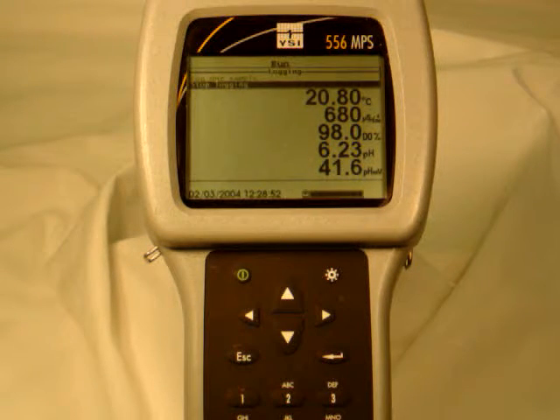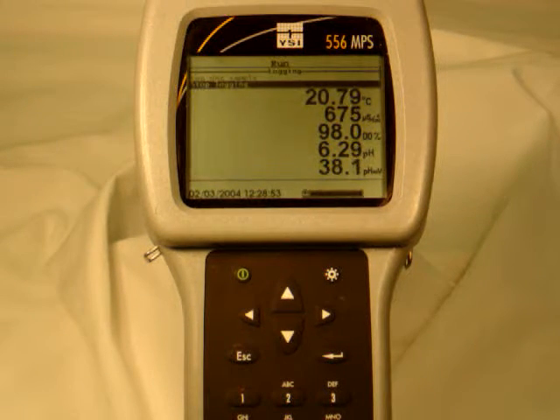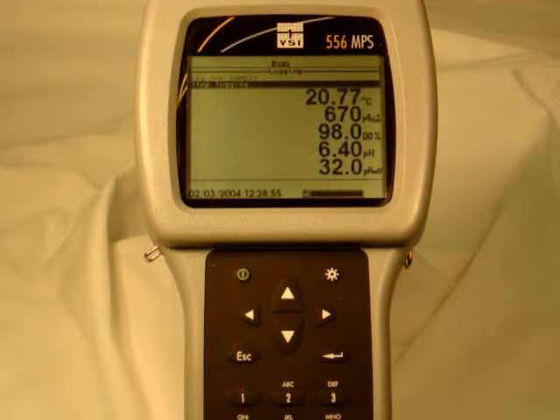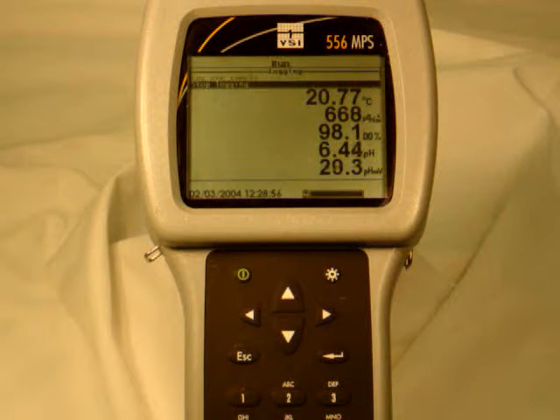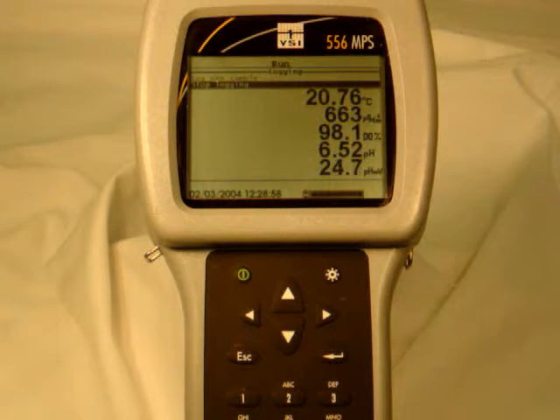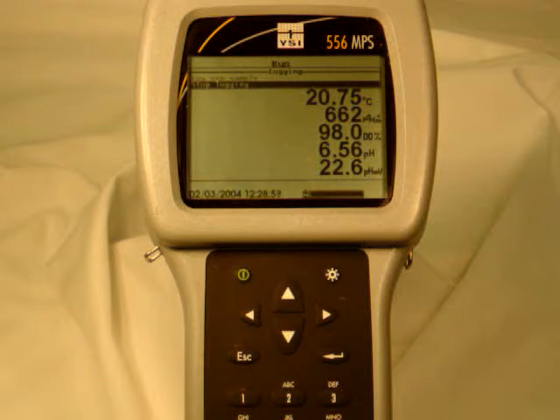Only useful if you've got the graph facility. Which they should all have. Just keep it stirring, keep the DO stable.